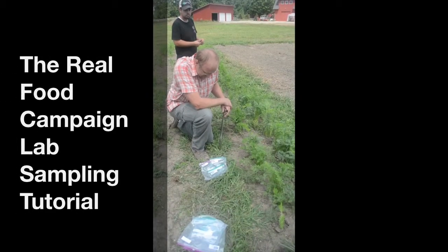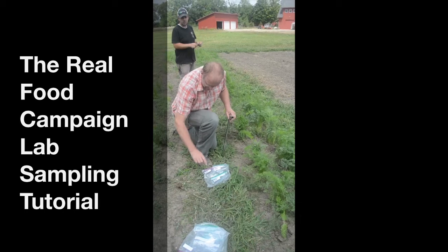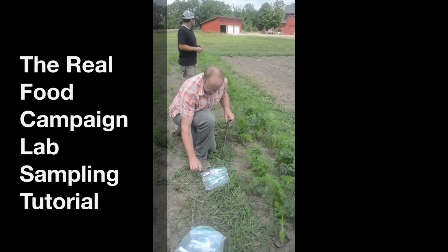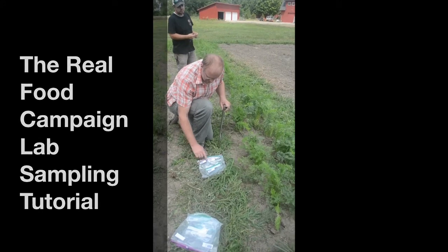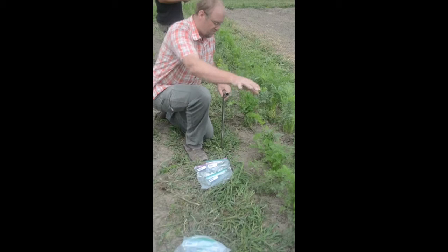Alright, so we're getting ready to take some carrot samples. One of the first things you always make sure is that the number on your sample bag or your produce cup, if you're sampling grapes or cherry tomatoes, matches the sample number on our soil samples. So we have a bed of carrots here.